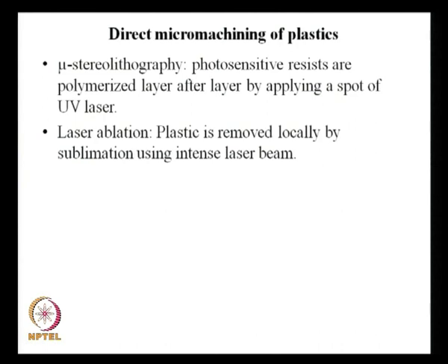The next technique is direct micromachining of plastics. Here you have a technique called microstereolithography, and the other technique is laser ablation. So, instead of using a mold that is a negative replica, you can do it directly.